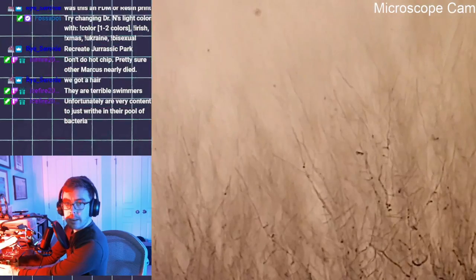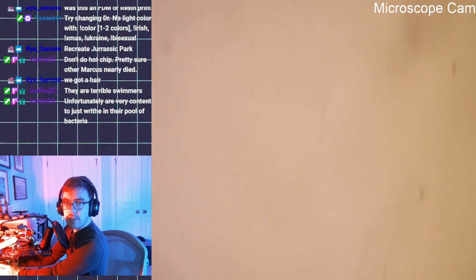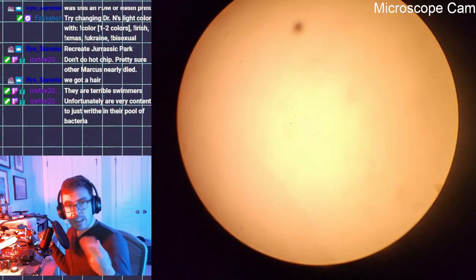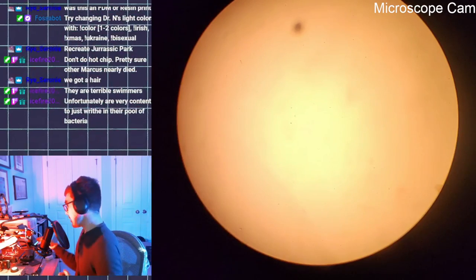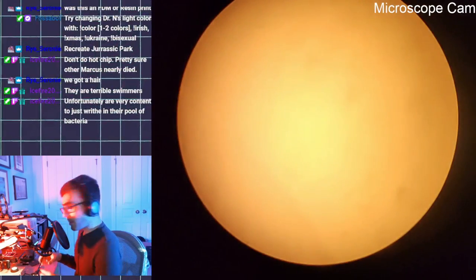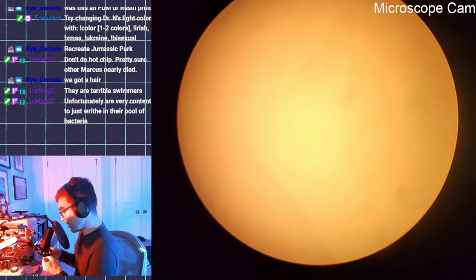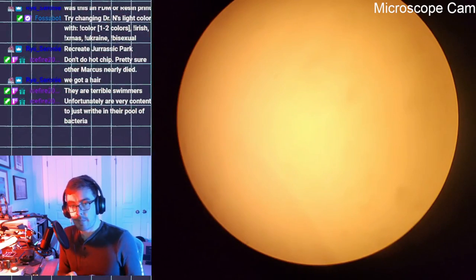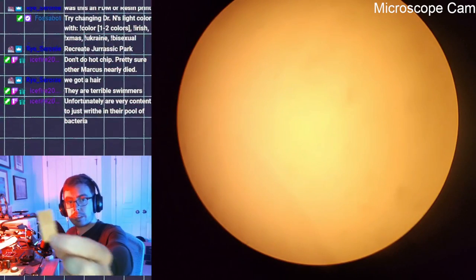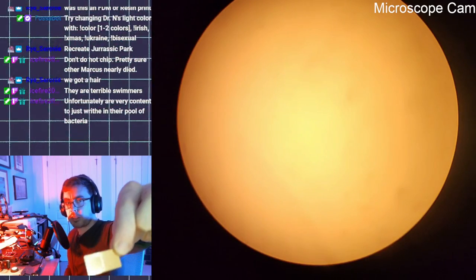Now we've got quite a bit of stuff growing on here. But the hyphae kind of end on this other section, which is agar. It's just squishy, wet material that maybe they would be able to swim on. Swim, crawl. Maybe they'd be able to crawl on. So I'm going to grab another 3D printed maze that I haven't taken out. This is what they look like. You can't even see it really. You can just barely see the channels.